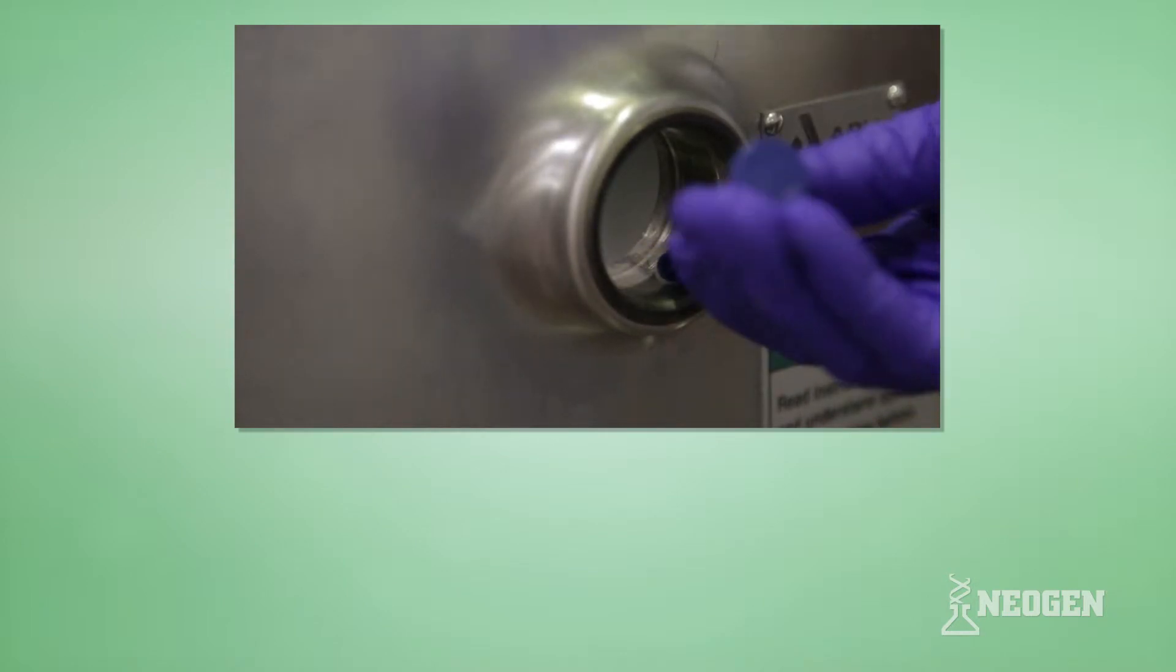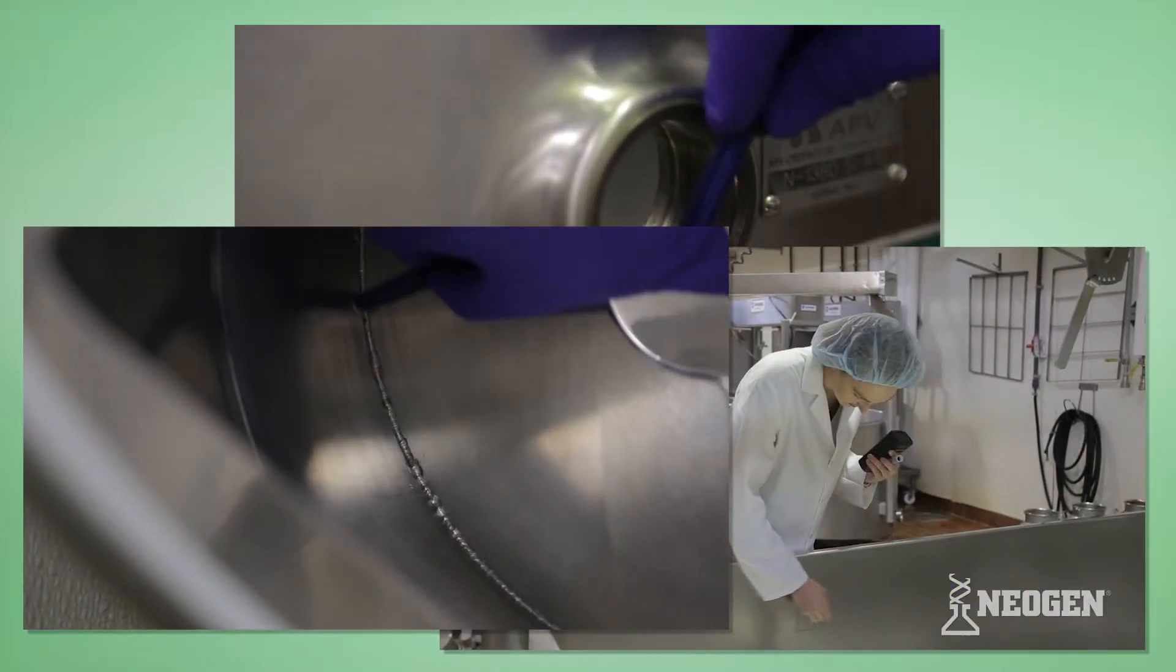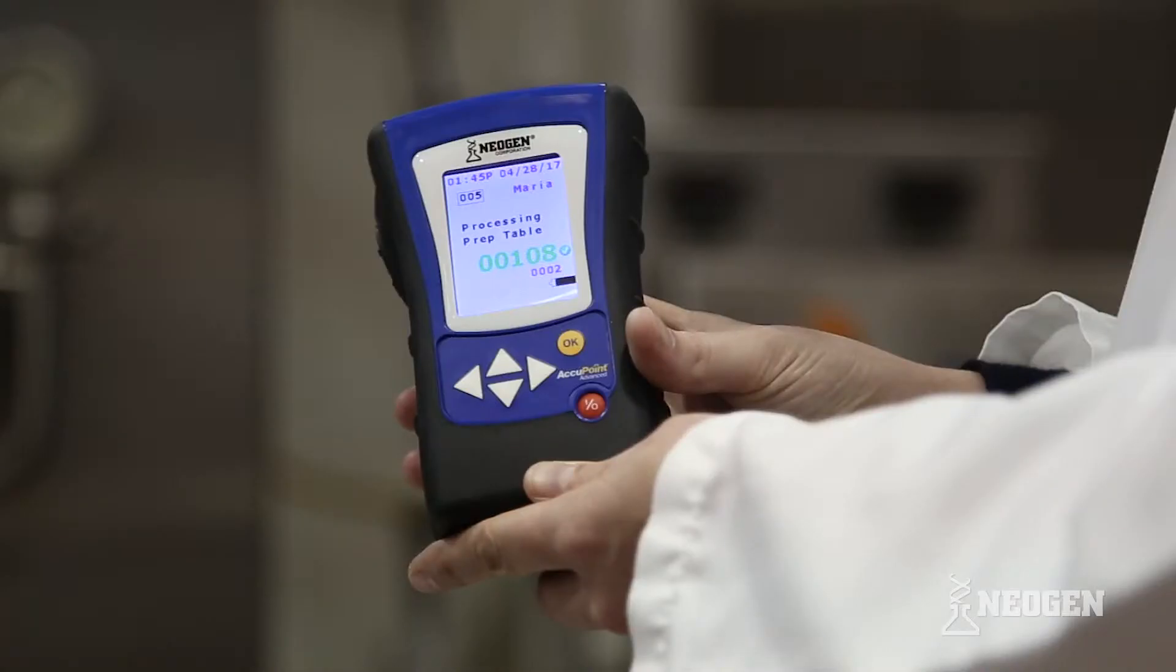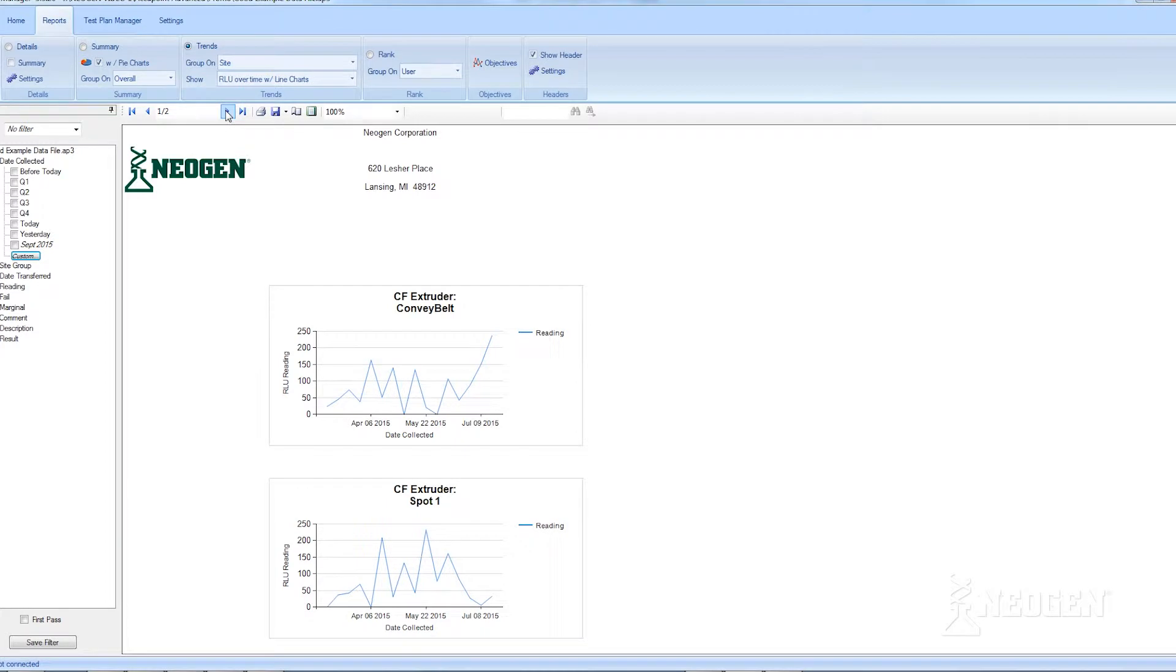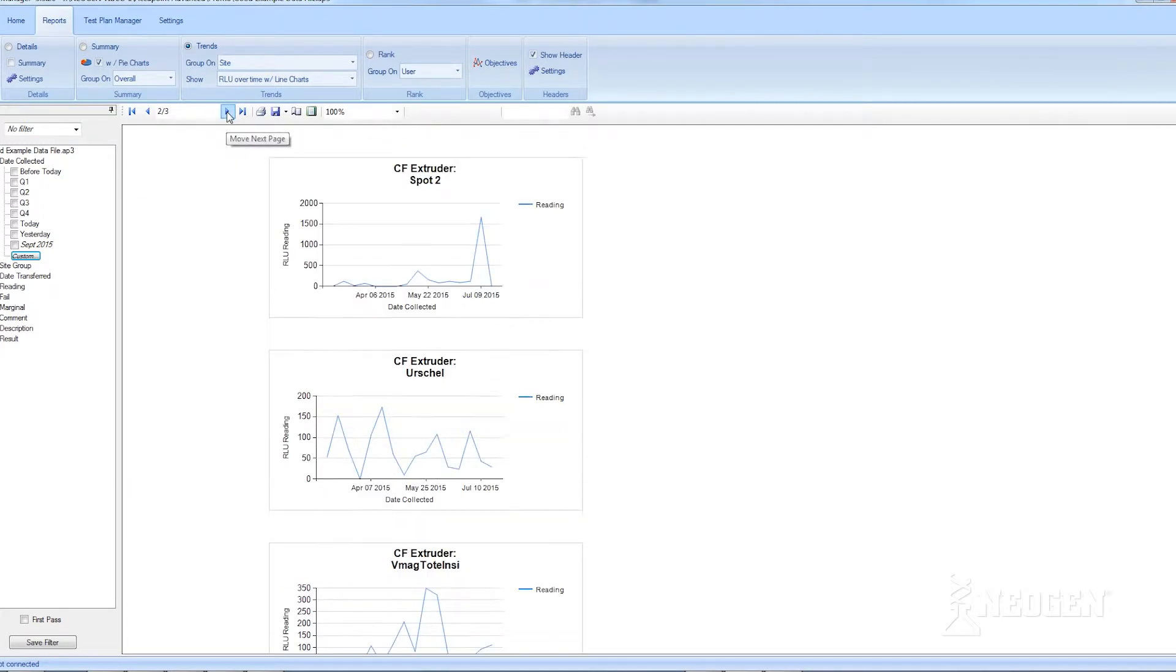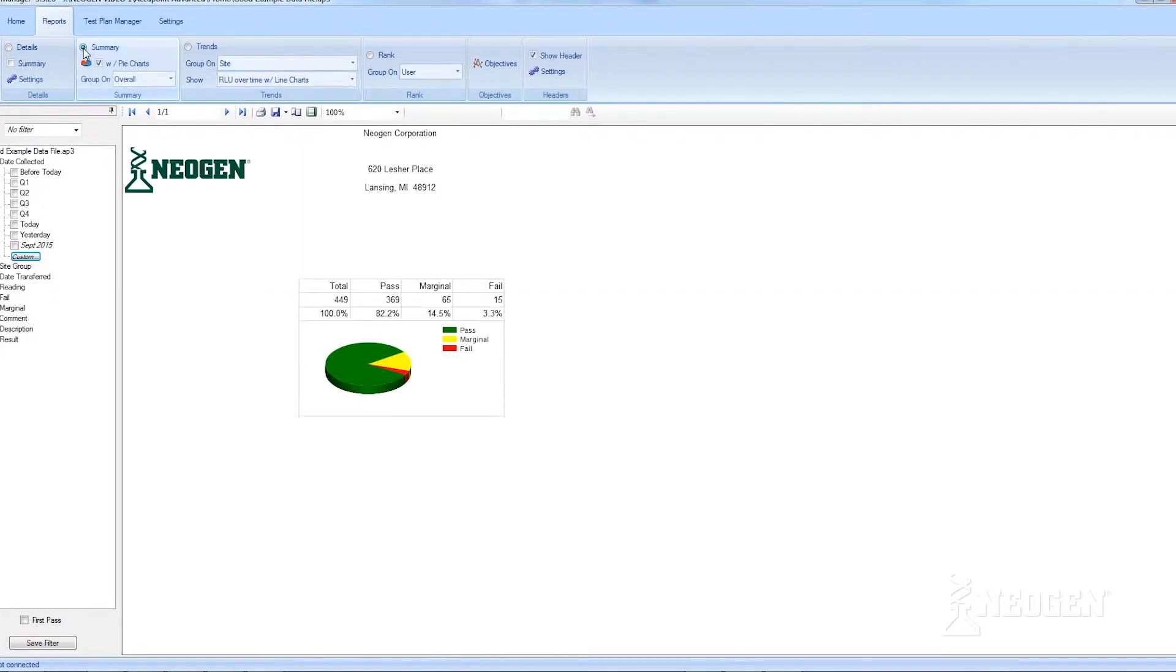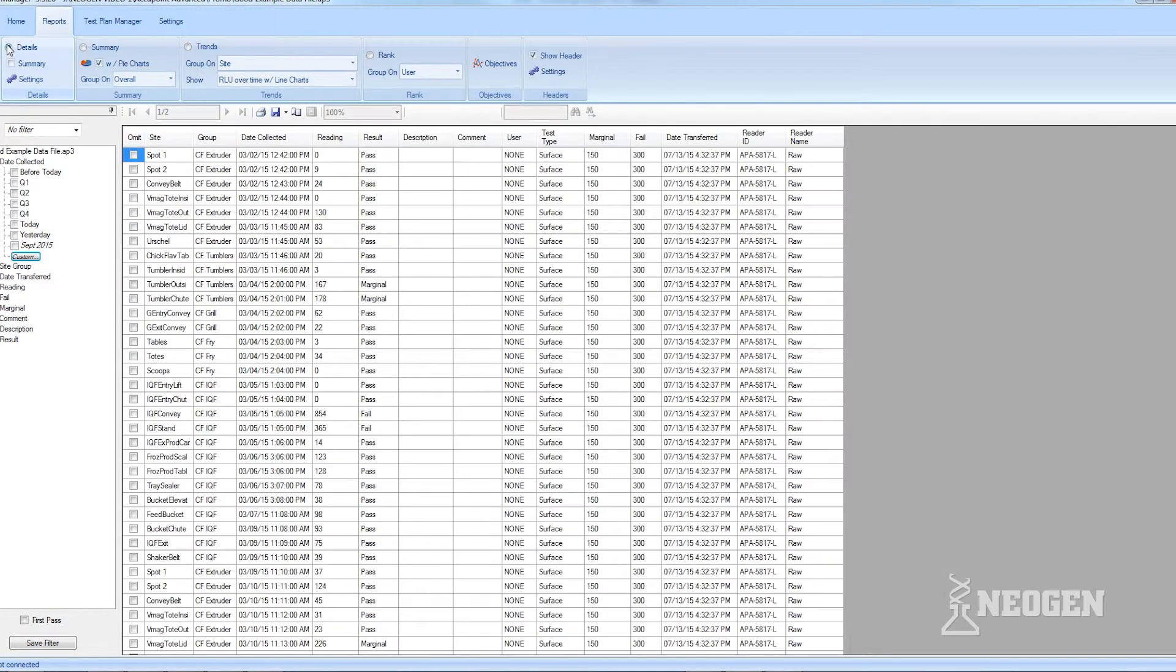Accupoint Advanced is the best system available for recovering ATP. Accupoint Advanced results are reported as Relative Light Units, or RLU, and its unique RLU scale allows for higher resolution across a broad range. Using the system's data manager software to review results can help detect slight changes in ATP levels.